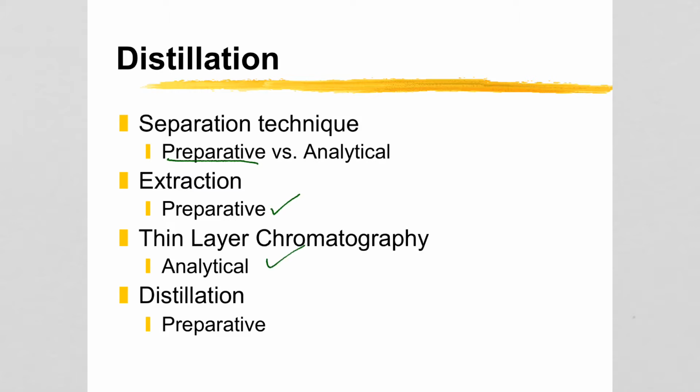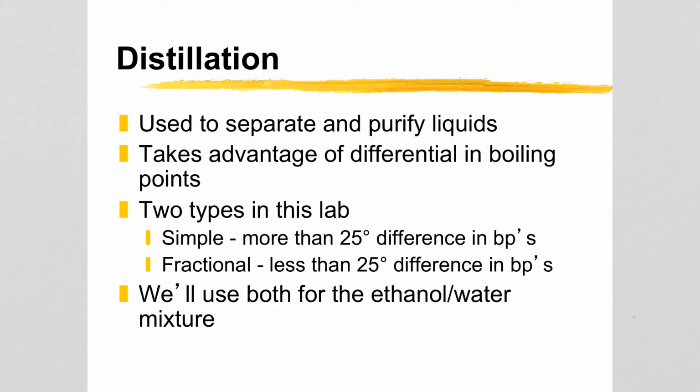And with thin layer chromatography, we were able to separate the components of an over-the-counter analgesic, but we didn't know how much of each one we have. Now, with distillation, that's a preparative technique, and at the end of the day, we will have, hopefully, very pure ethanol in hand. Now, a little bit of information about distillation.